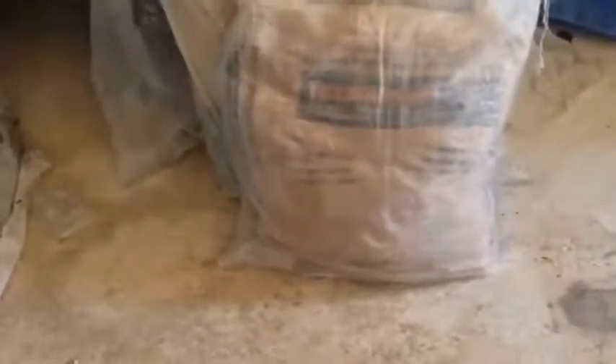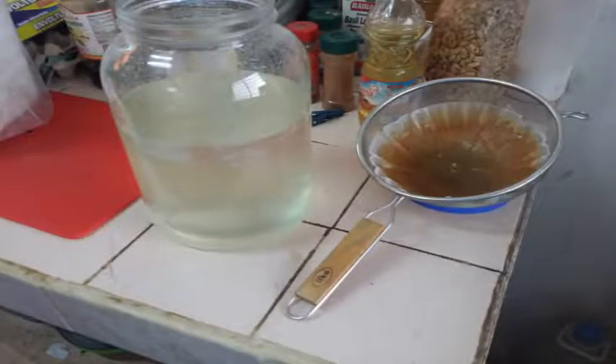I bought this zinc sulfate from the farm supply in hopes that I could use these salts as my electrolyte for making batteries. It says on here 'feed ingredients,' so these are food grade quality ingredients. I originally tried using them just as they were and I did get results. This past week I have tried purifying them, trying to make them closer to technical grade or reagent grade.